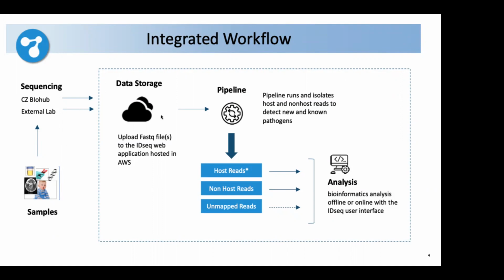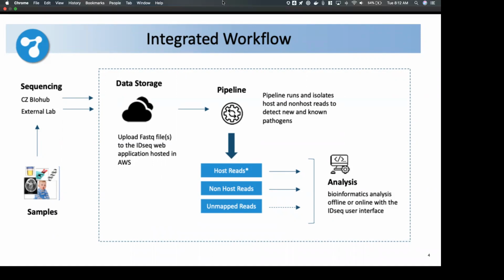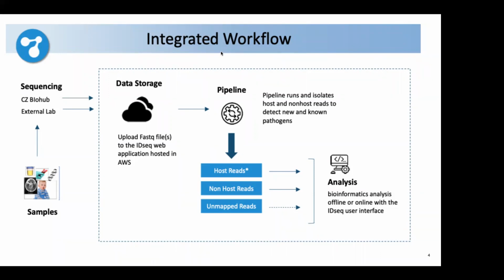So once you upload those data files to IDseq, that will automatically kick off our pipeline within IDseq that starts isolating host and non-host reads. And this is in an attempt to identify what microbes or other organisms are present in the sample.